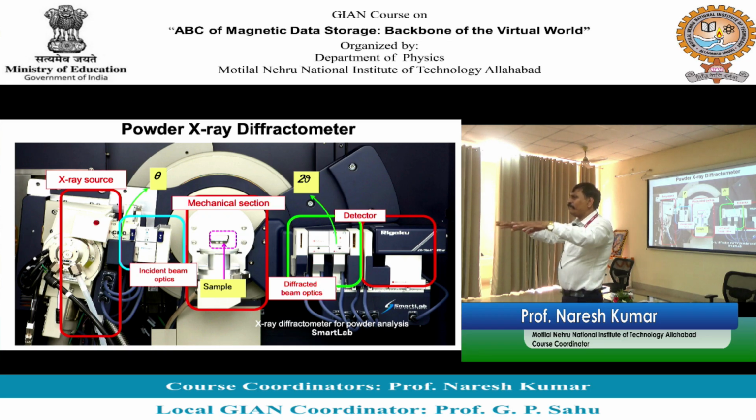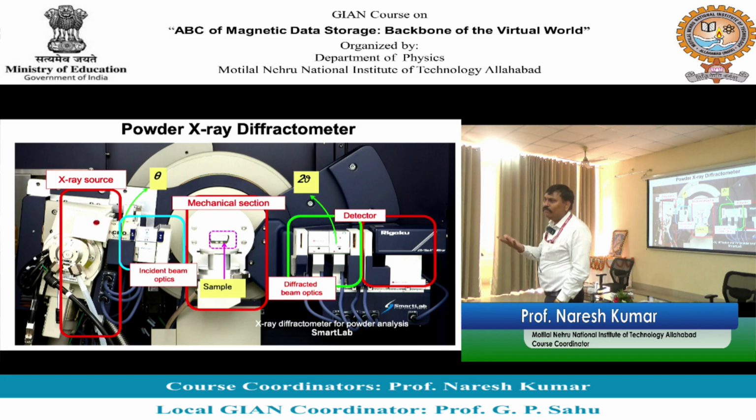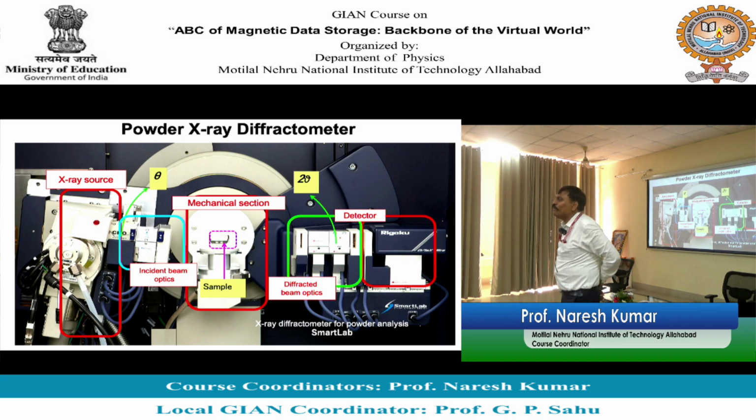If you have five similar kinds of orientations, five different types of planes, then how many planes would I be observing? 5 planes. 5 planes means more than one plane. More than one means poly. So we call those materials polycrystalline, है ना? अच्छा, if there is no oriented plane available, crystalline material है ही नहीं, तो क्या मिलेगा? Bragg's condition satisfy नहीं होगी, मिलेगा क्या?